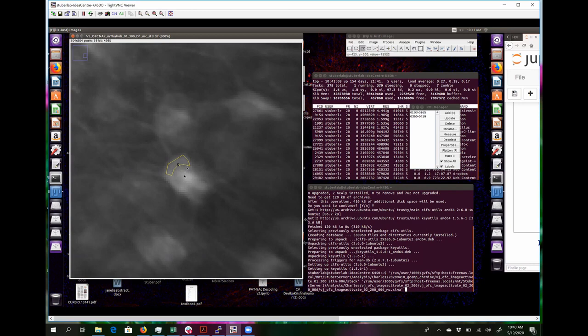Because at least there may be processes coming out of the cell that are in that region. It's possible, but again, you can't see anything by eye, so it's not resolvable. Nothing resolvable exists within that field of view, within that region of interest. If you want to be less conservative and draw all parts of the cell that are not overlapping, then you would need to look at the video. But this suffices. That's more than 15, 20 pixels, and this is more than enough to get a reliable estimate of that sensitivity.